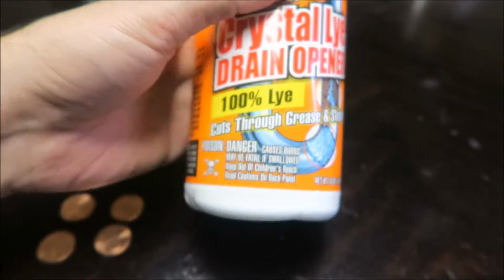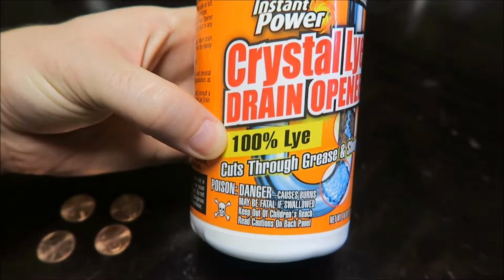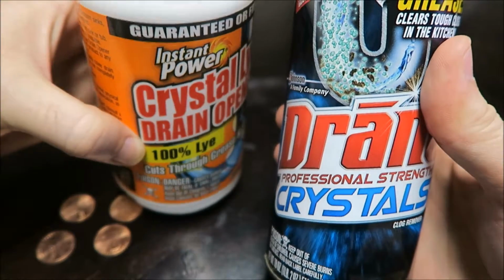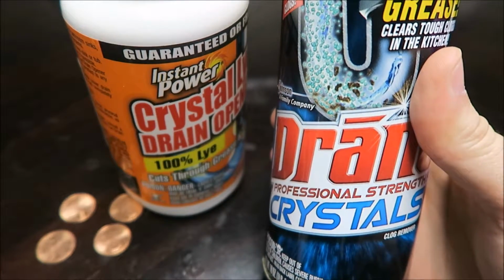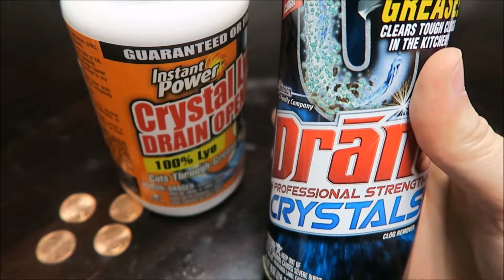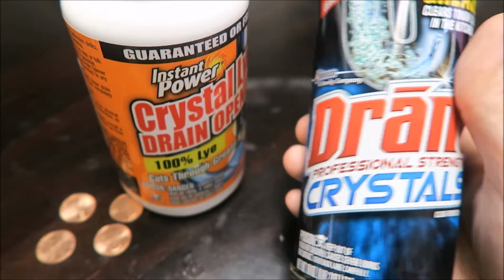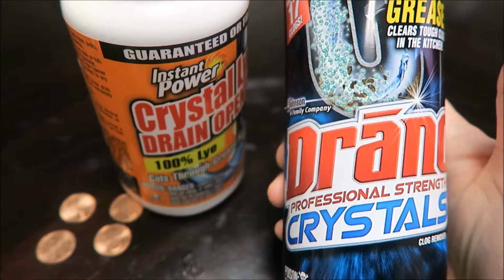Also, make sure that it is 100% lye. Some other drain cleaners, like this one, do contain sodium hydroxide, but they also contain foaming agents, soap, metallic flakes, and other ingredients that reduce its efficiency, at least for this project, even though these are easier to find.